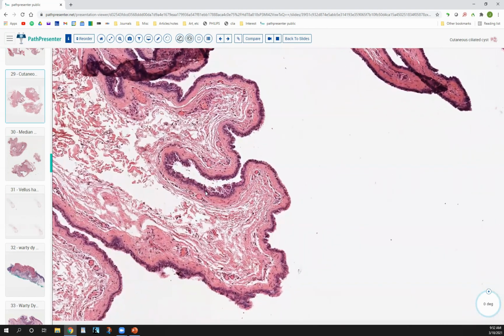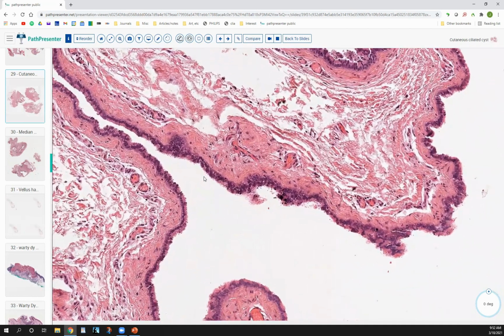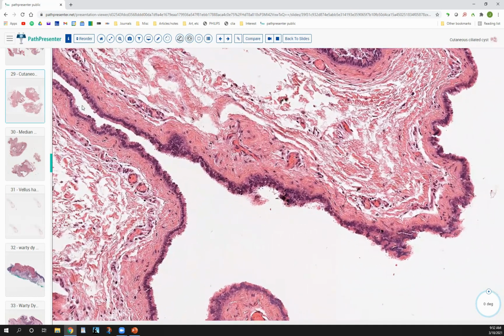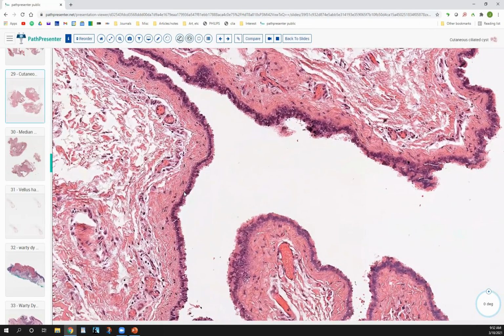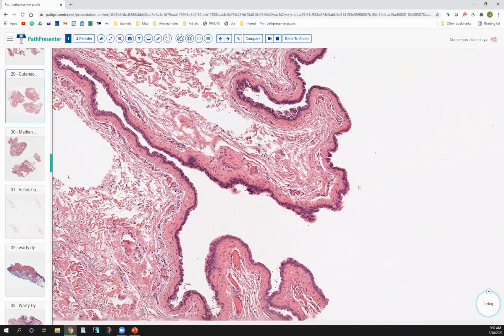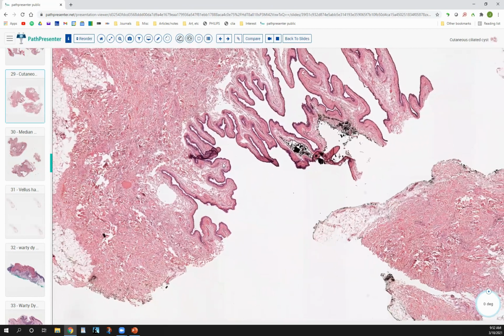Location, again, helps with these. It's kind of an ongoing theme with these unusual cysts. And the epithelium for all these ones I've been talking about seems to be pretty common among them. You have that pseudostratified with the ciliation. So good one to know. We may see one of these occasionally.